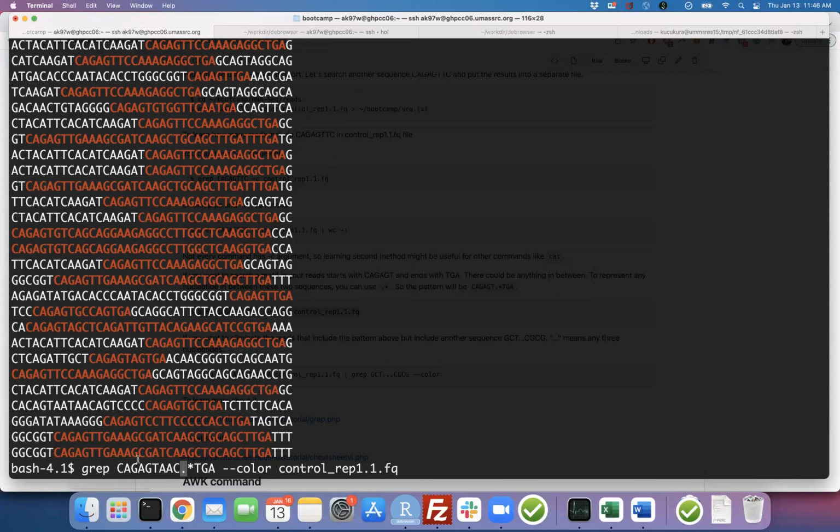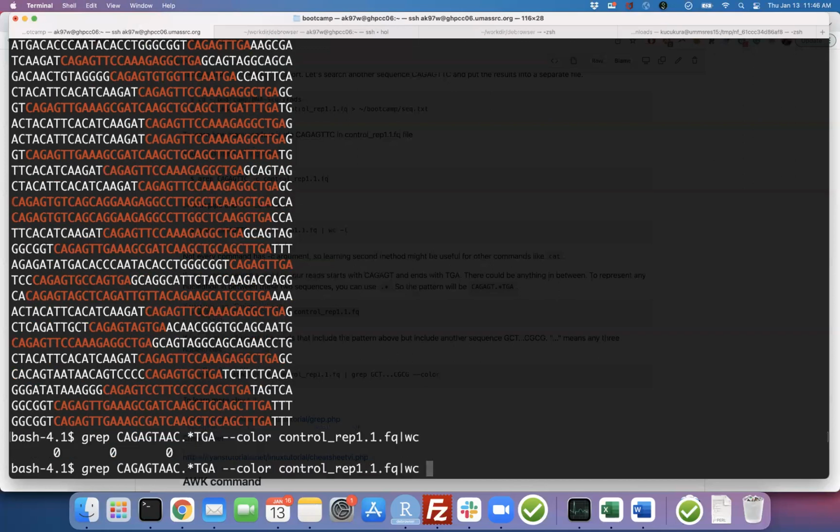We are using Trimmomatic or different algorithms to allow that error to match to this site and trim that adapter out, and use that sequence we introduce, for example, in that specific cell type. So that's why this is the easy version. It will just tell you how many of my sequences have that, just to do your fast checks.